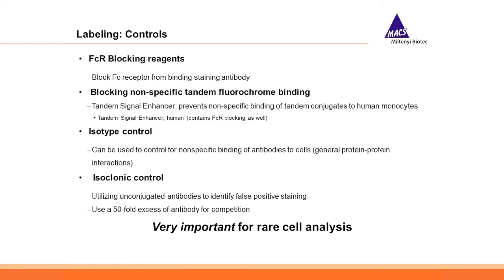So when the binding of the antibody to the molecules is specific, you should not get any signal with your staining antibody, or at least, if a little bit, then maybe only a highly diminished signal, then you know, okay, the signal I get in my normal staining sample is specific. If you still get a signal after the saturation process that you did here, that means that the antibody sticks not onto the epitope, so not by antigen-specific binding, but by some other mechanism.